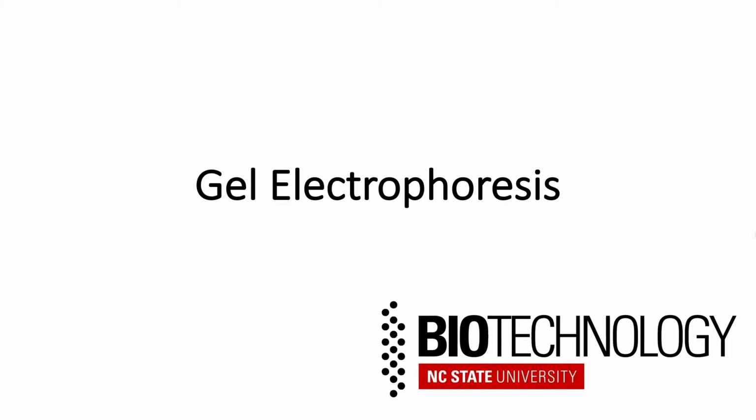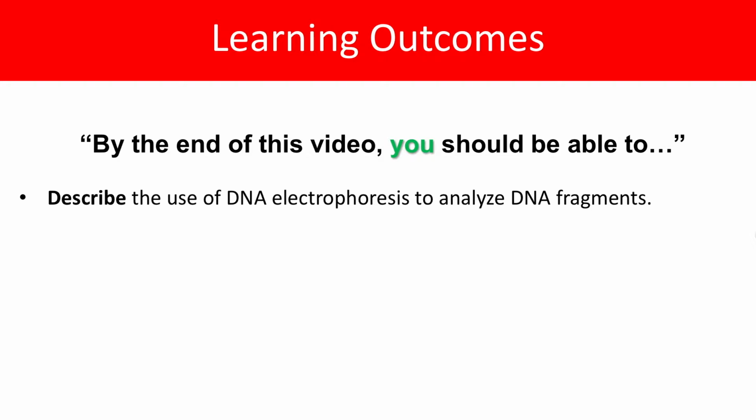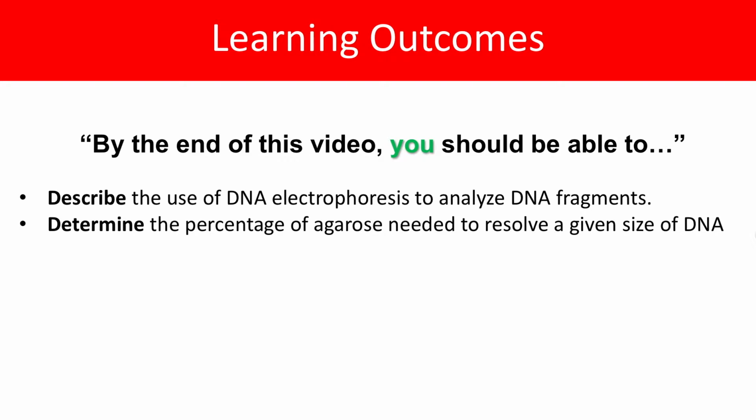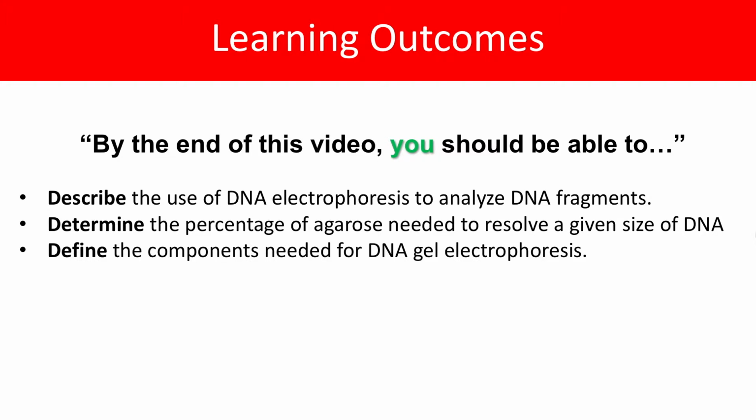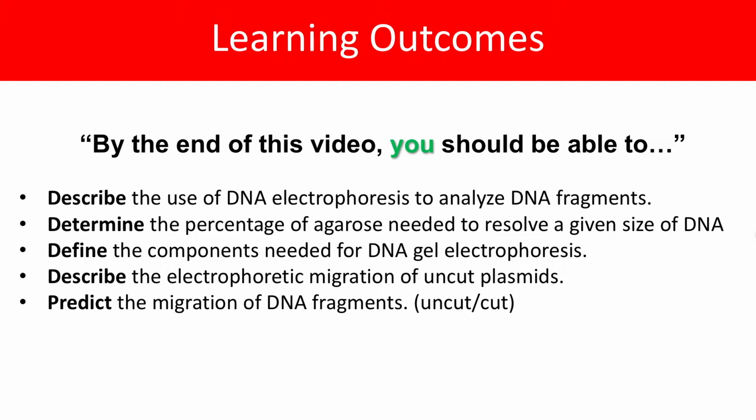Today we'll be talking about gel electrophoresis. By the end of this video, you should be able to describe the use of DNA electrophoresis to analyze DNA fragments, determine the percentage of agarose needed to resolve a given size of DNA, define the components needed for DNA gel electrophoresis, describe the electrophoretic migration of uncut plasmids, and predict the migration of DNA fragments.